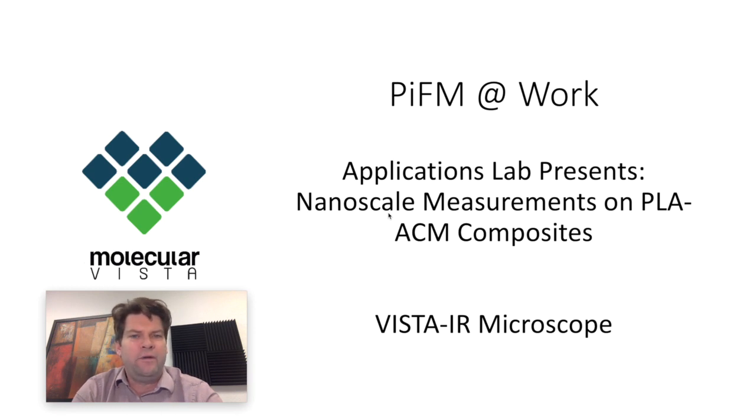And so for the next few minutes, we'll start out with an introduction to the sample, followed by a short imaging session just to familiarize with the instrument, followed then again by some data analysis highlighting the spectral and spatial capabilities of the tool, and then we'll wrap it up with a short conclusion. All right, well, with that, let's get started.